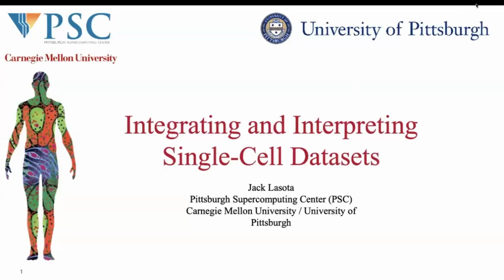Hello, everyone. My name is Jack Lasota, and this summer I've been working at the Pittsburgh Supercomputing Center. My project is on how we process, analyze, and integrate single-cell RNA sequencing data within the HuBMAP framework. This included raw data handling, open source Python-based toolkits, and approaches to align and interpret data sets across tissue types.